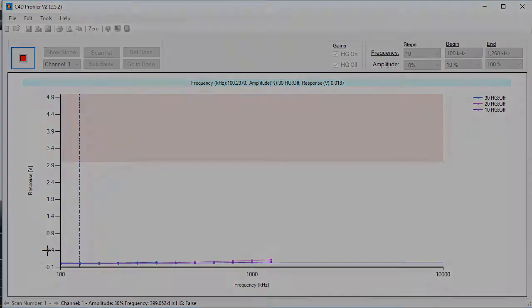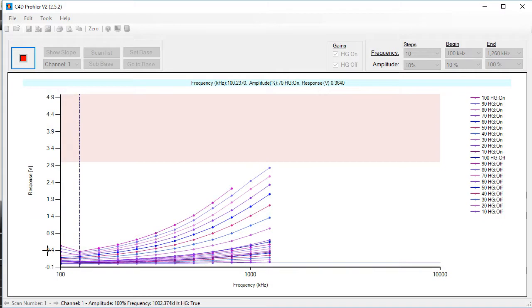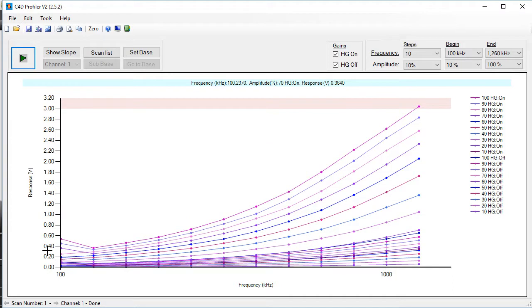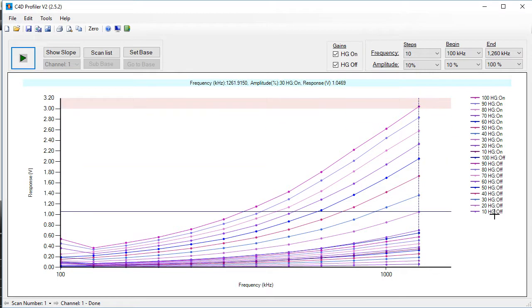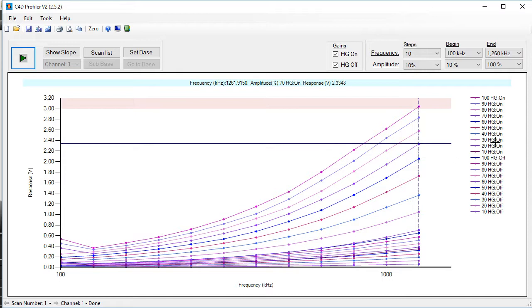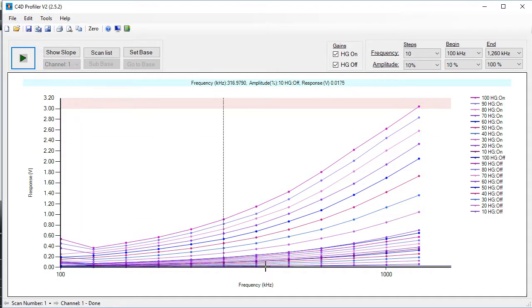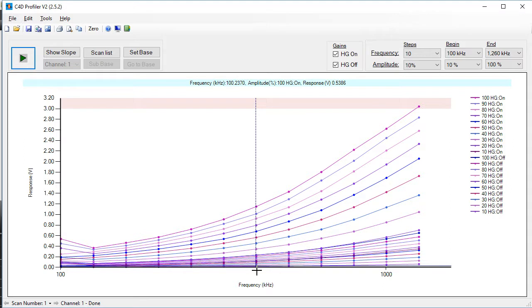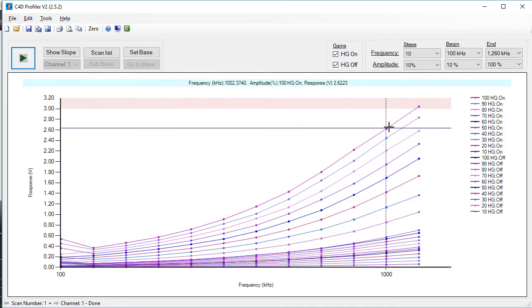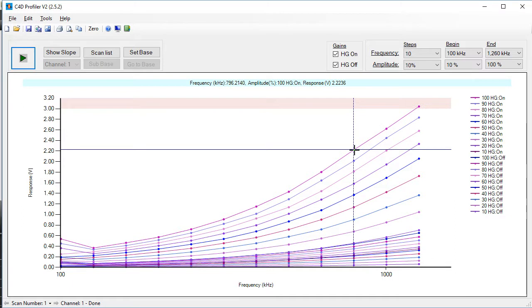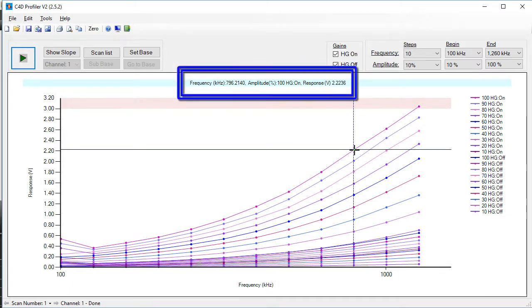It's going to try every frequency between 100 kHz and 1260 kHz and give the response. This may take a while to do. When the profile is finished, you should get a profile which looks a bit like this. If you have a more conductive background electrolyte, it might go up into the area where the detector is overloaded. You can see it's tried every amplitude with the head stage gain off, then on, for every frequency. You should ignore any C4D settings that give a value higher than 2.5. For example, these points here should be ignored. You could decide to use settings where the amplitude was 100%, the head stage gain was on, and a frequency of about 800 kHz was used.